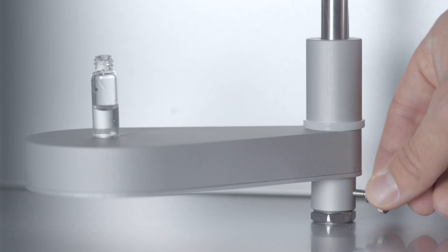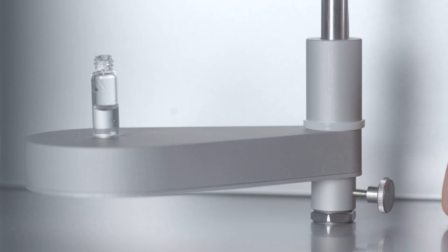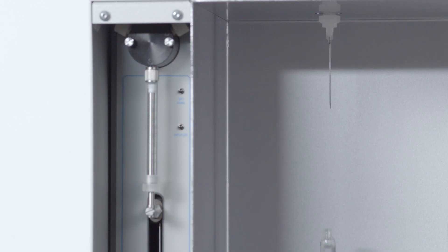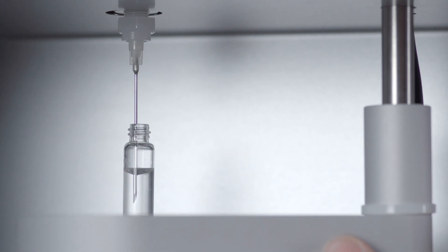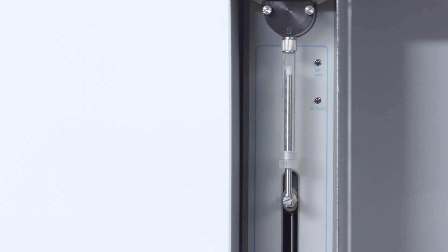These features eradicate the need for constant refilling of the sample, and more importantly, reduce the possibility of cross-contamination.